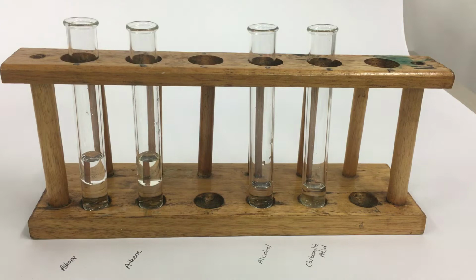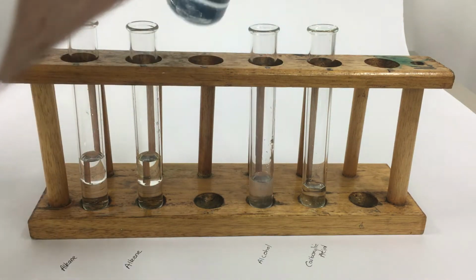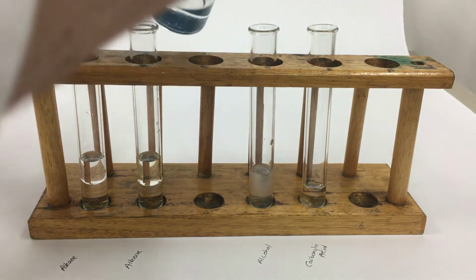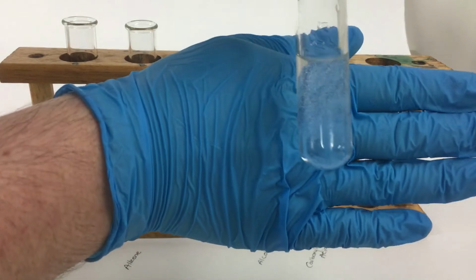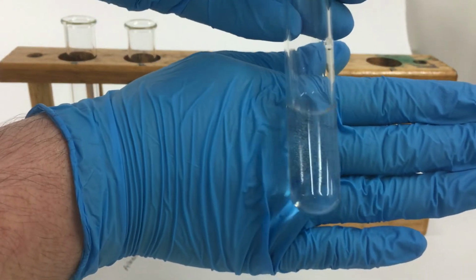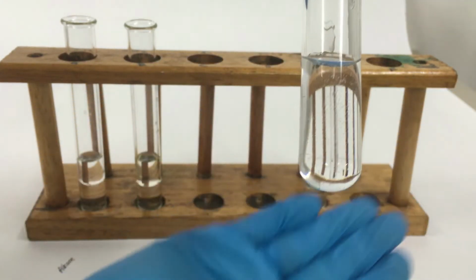For the ethanol, we're using as the alcohol here. Now that's gone through a bit of bubbling from the test tube, but that's definitely miscible, so that's gone into a single layer.